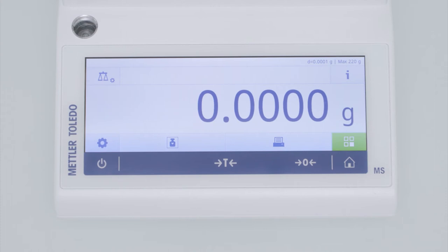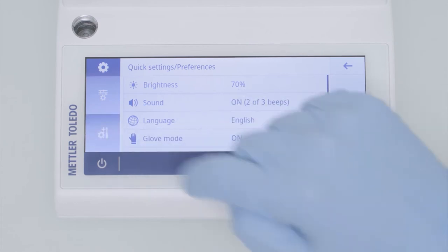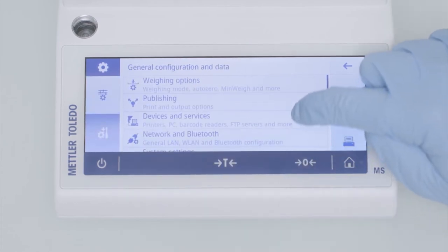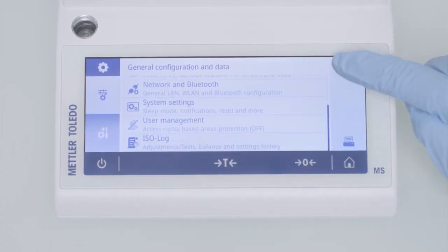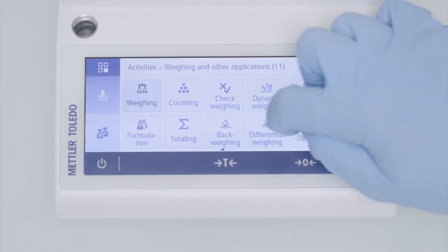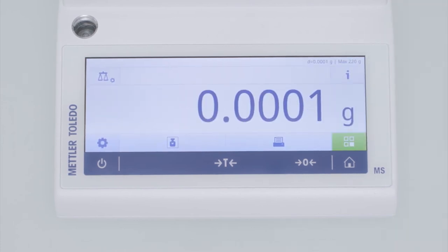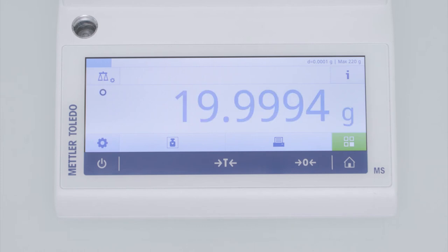Thanks to the large display that covers almost the entire width of the balance, the weighing results can be displayed large and clearly. The user interface is logical and intuitive to configure your balance according to your needs, and also to support you in your daily weighing tasks with clever weighing applications like formulation or differential weighing, which guides you through your process, records and calculates all relevant data automatically.